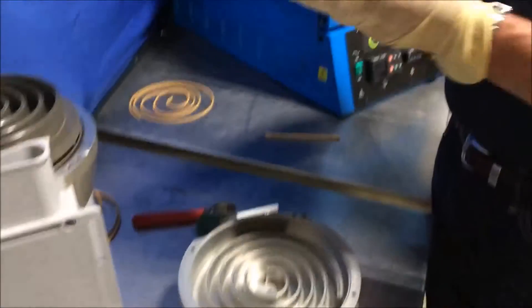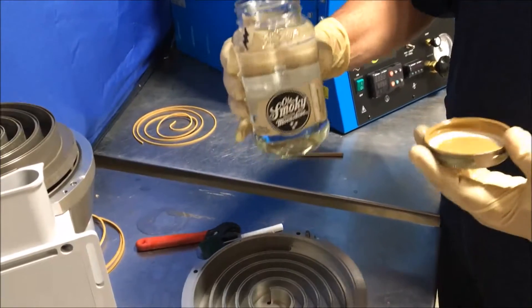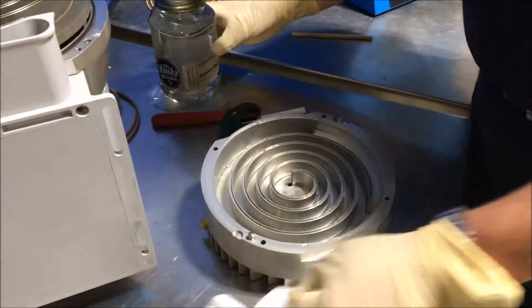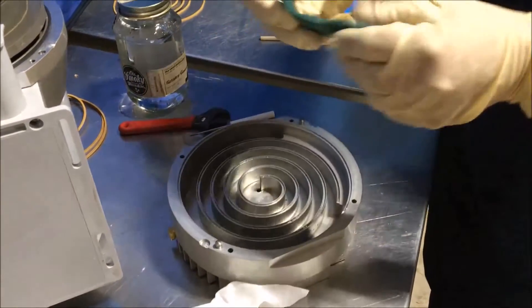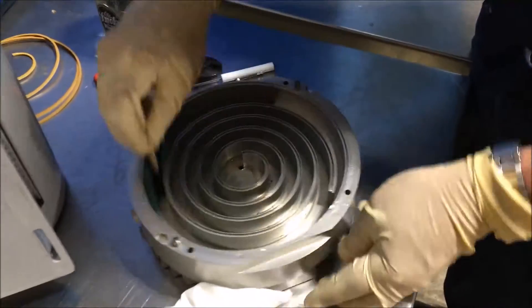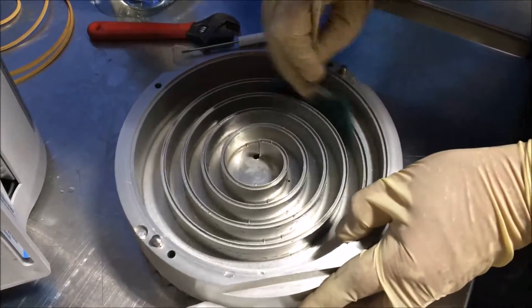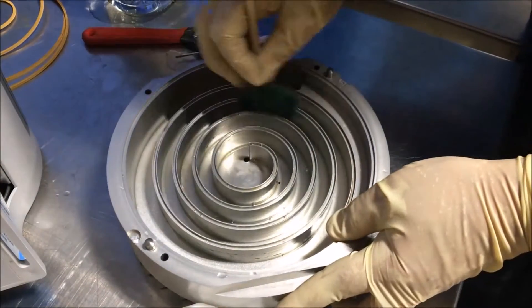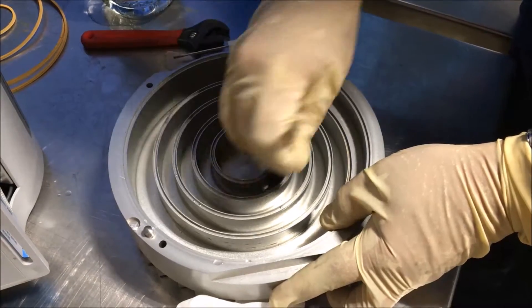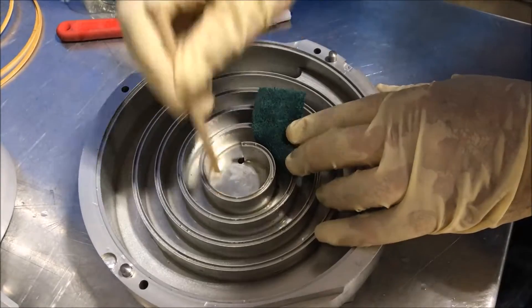We use 100% grain neutral spirits, Everclear, or White Lightning as a solvent to clean. We use a little piece of emery cloth with a wooden dowel to go in and scrub the root of the scroll to remove any buildup. This is the most important part of the cleaning process — remove as much as you can, especially where the wall meets the root. Get anything in that corner out.